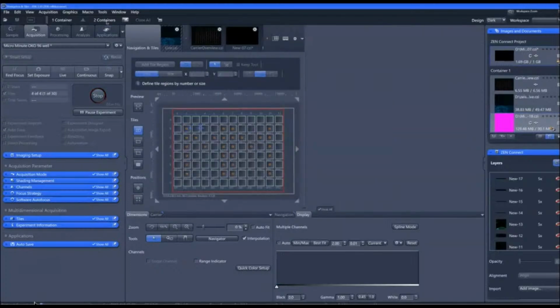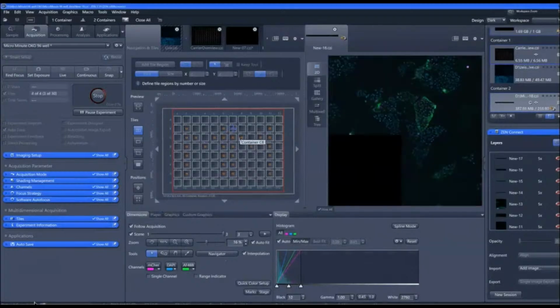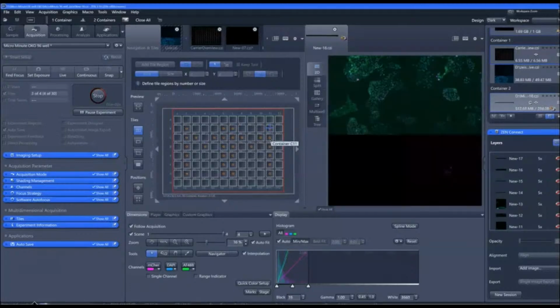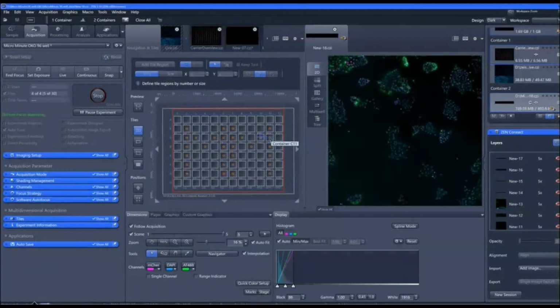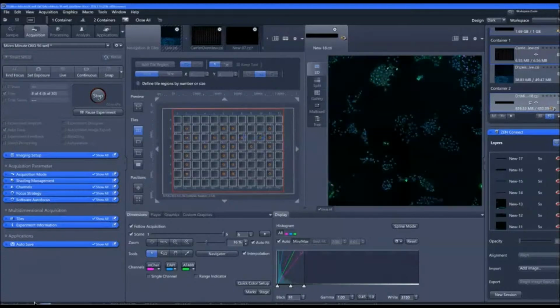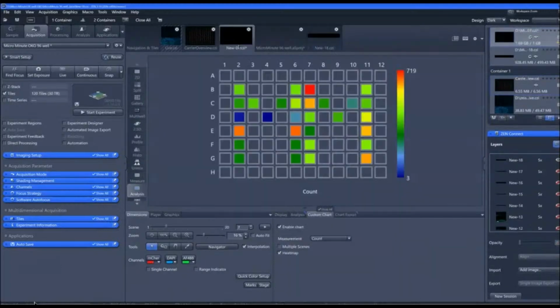I will do a 2-container view quickly and drag this image over here so you can see in a side-by-side view how it acquires data as it progresses through all of the tiled regions. So this experiment will go on for less than 3 minutes. And I might actually stop it right here because I have data that I acquired previously and show you how that looks. So let me just stop that and go back to a 1-container view to show you this image that I just acquired.